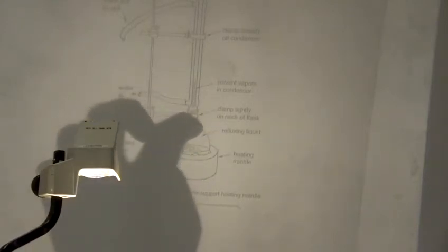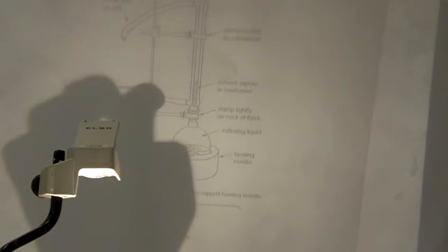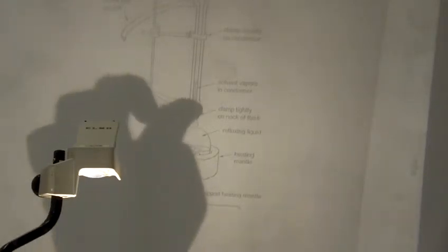You're going to clamp your reaction flask really well. Then you're going to put your Liebig condenser on top. You want a clamp here that's loose, so you can raise your flask up and down once it's done heating. And you're going to have water in your condenser to keep your solvent condensing, okay? So water in on bottom, water out on top, so that you're fighting gravity and fill your condenser, okay?